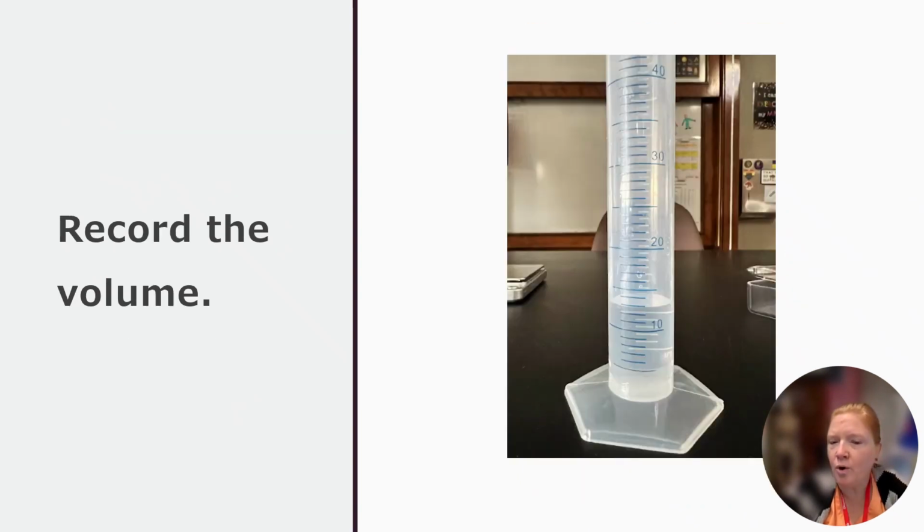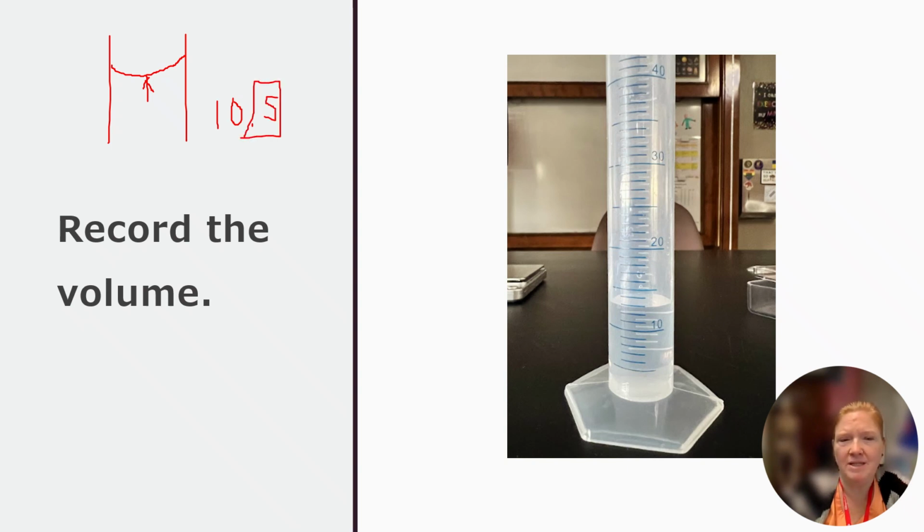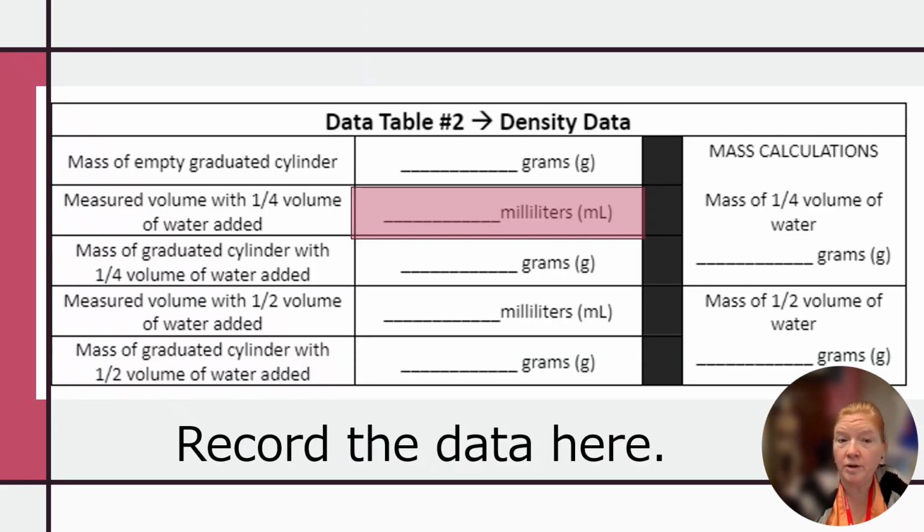And now you are going to record the volume. Remember, when I'm looking at the volume, there's going to be a meniscus, and I'm recording right here from the bottom of the meniscus. If you read the directions, you know that my measurement, let's just pretend it's halfway between 10 and 11, would be 10.5. My measurement needs a point and a decimal. So if here is 11 and here is 10 and my meniscus looked like this, I could estimate that as 10.5, halfway between. And I'm going to record that in the table.